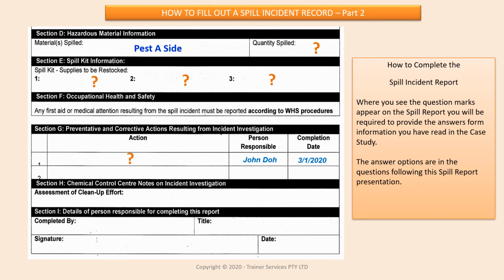In section H, you need to insert your assessment of the cleanup effort, which can simply say successfully completed as per SDS instructions. And in section I, you need to put your name, signature, and the date you completed this report.